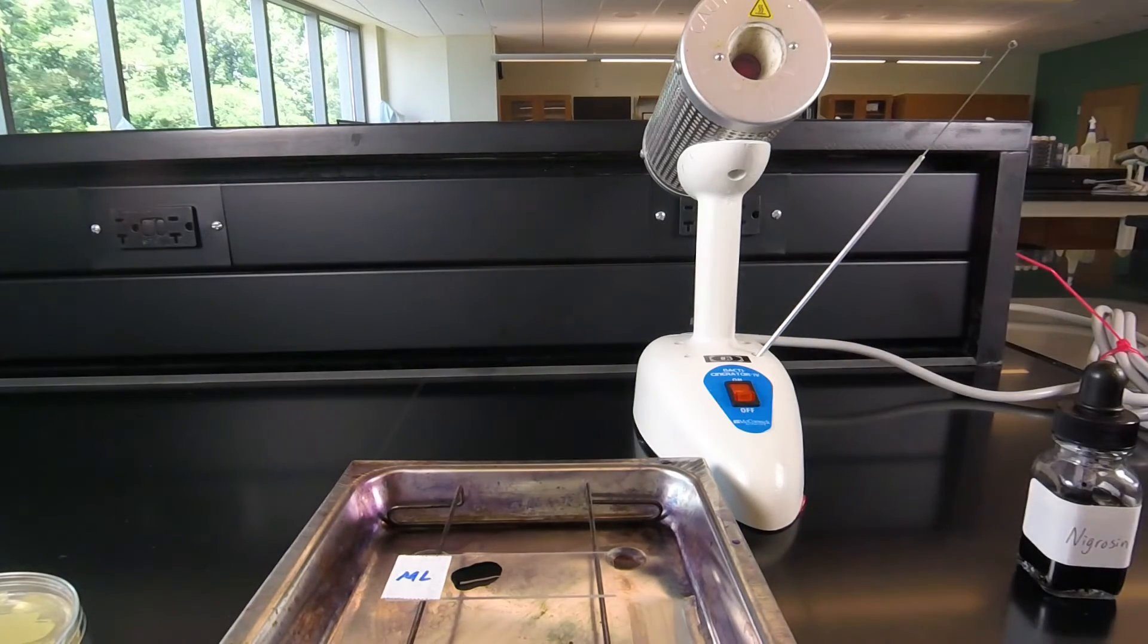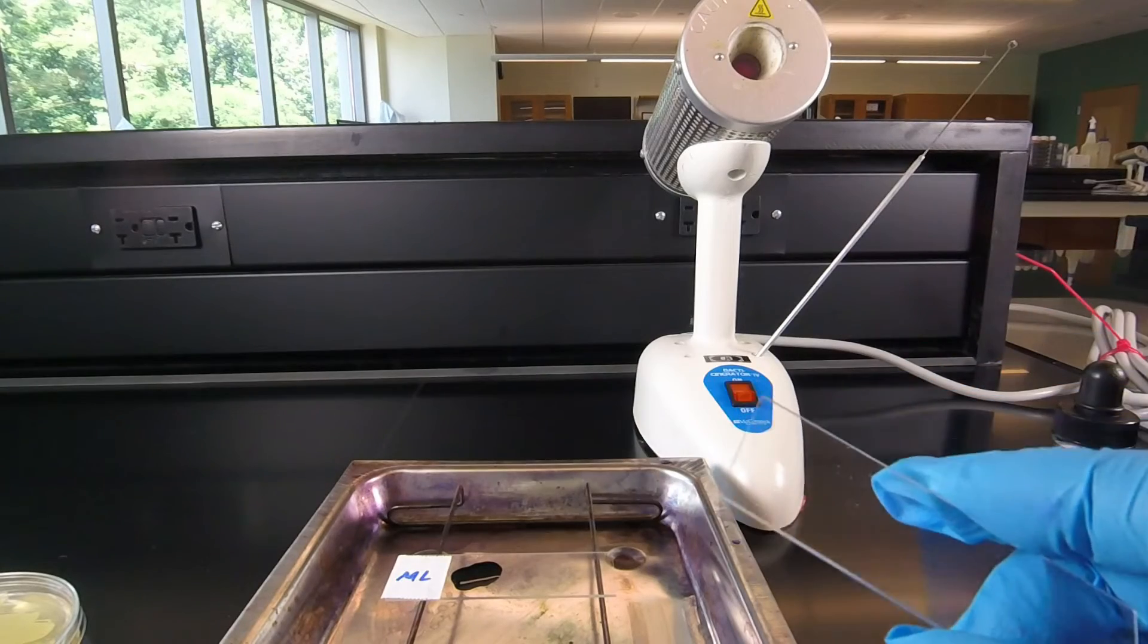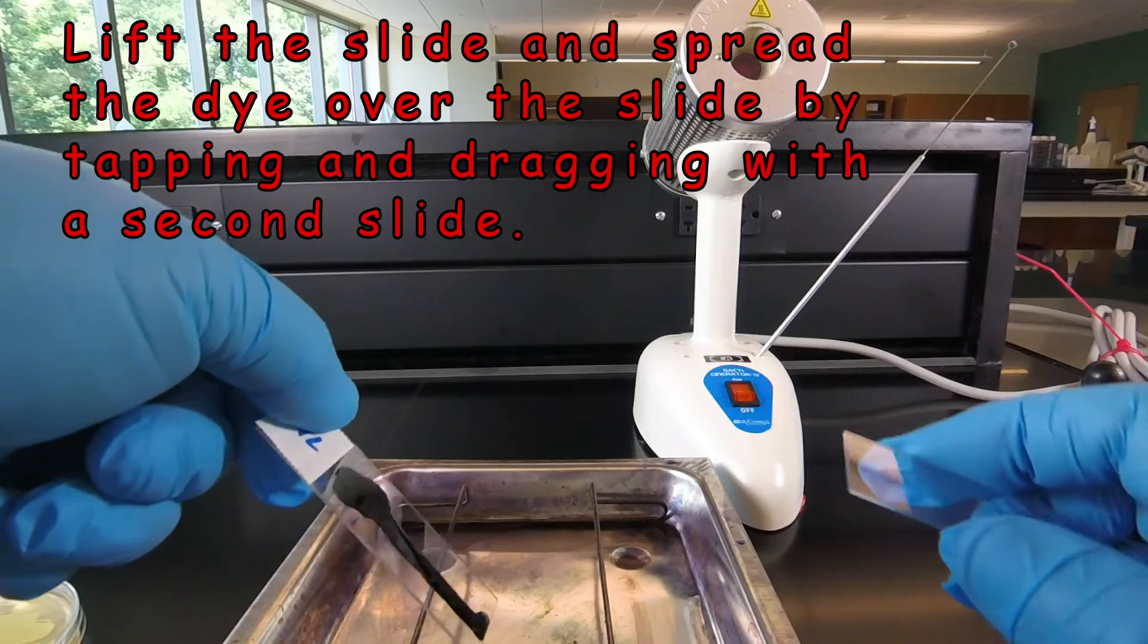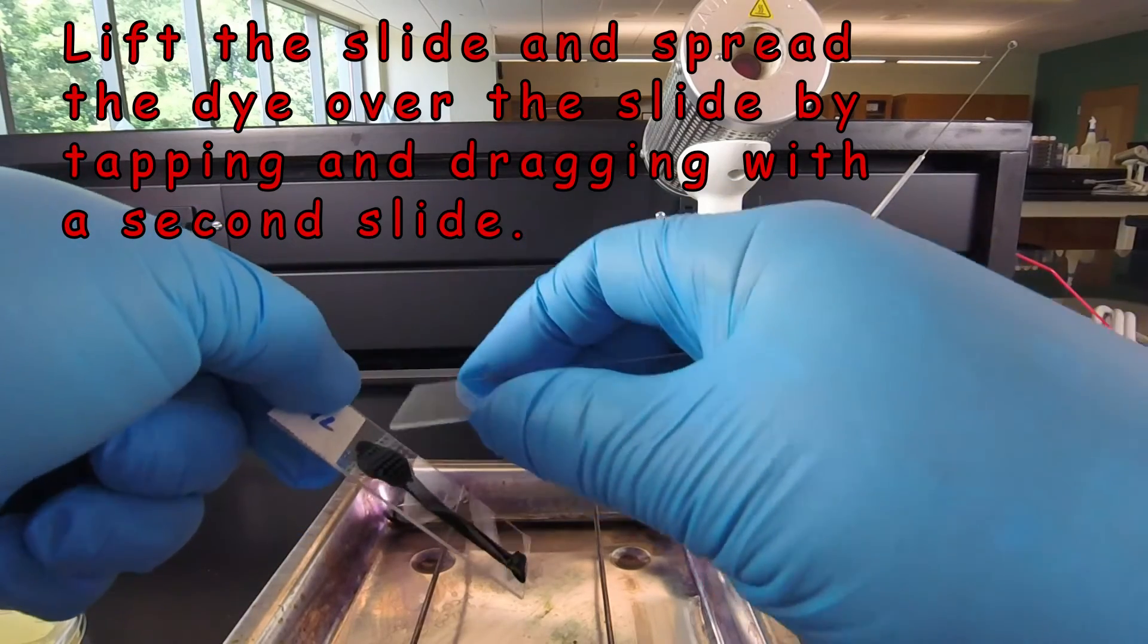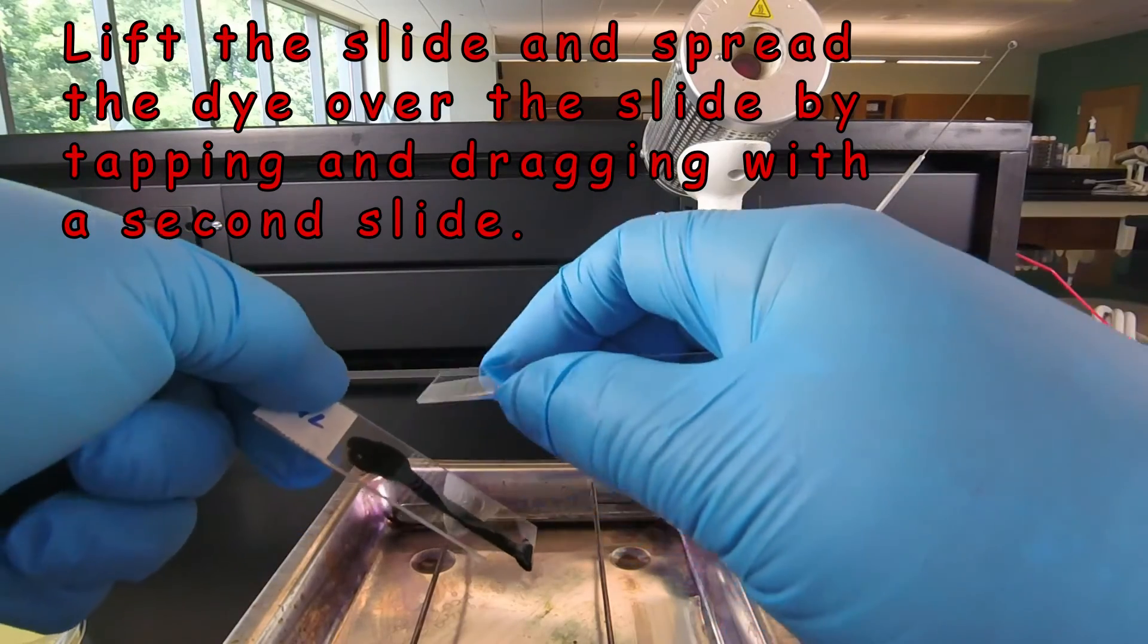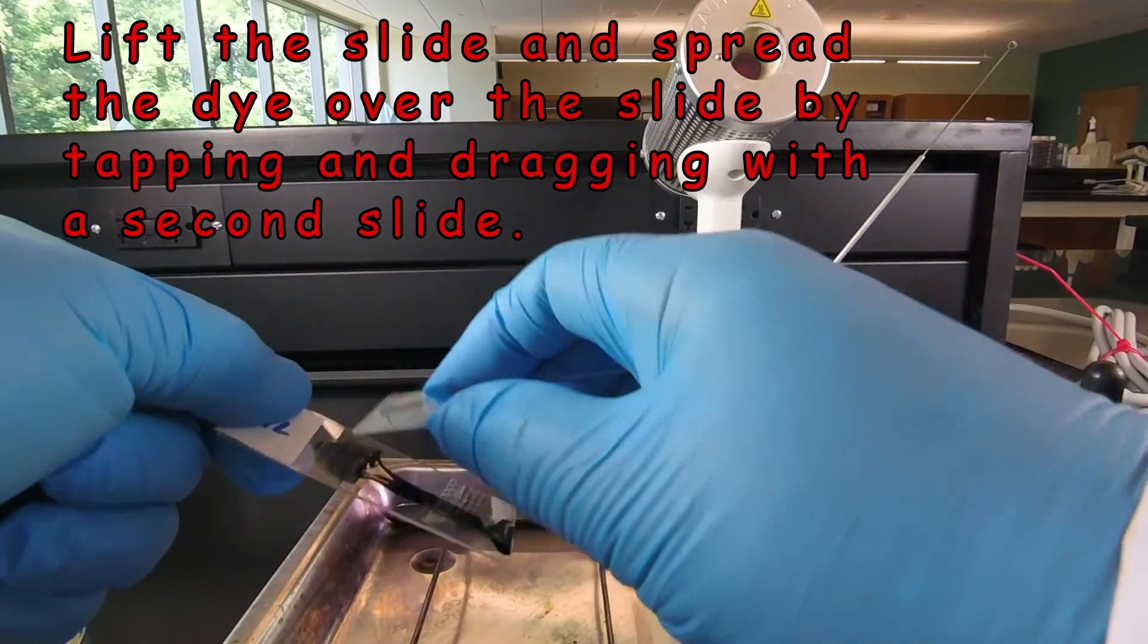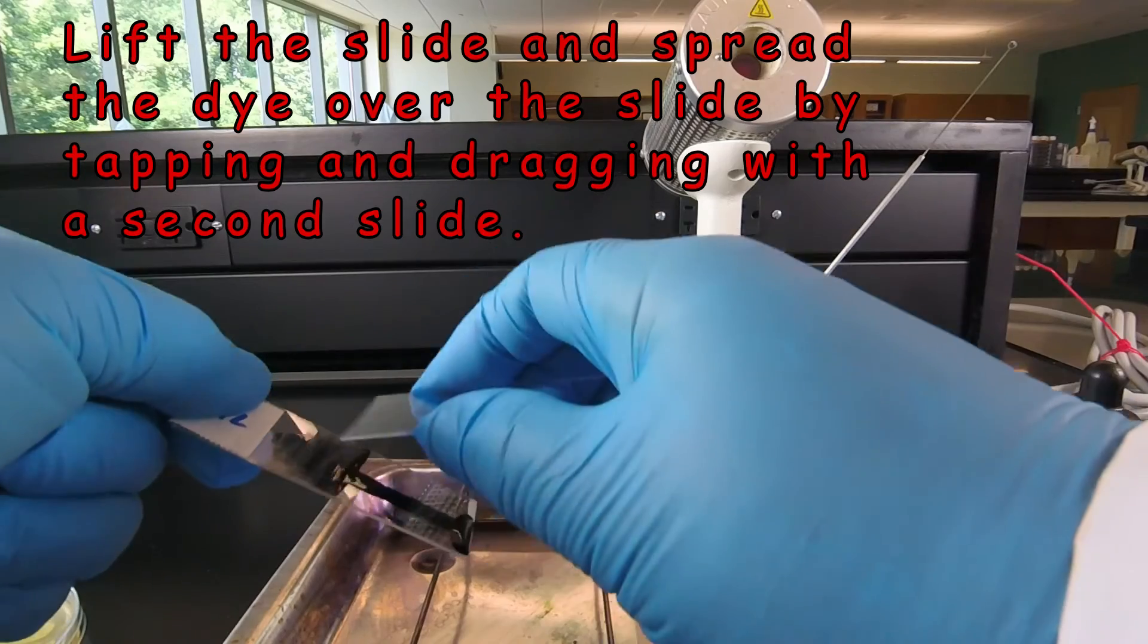And what we're going to do now is take the edge of another microscope slide, pick up our indirect stain, hold it over the tray, and we're going to start rubbing the slide down, tapping it to the side with a tap and drag motion. We tap it and drag it like this.